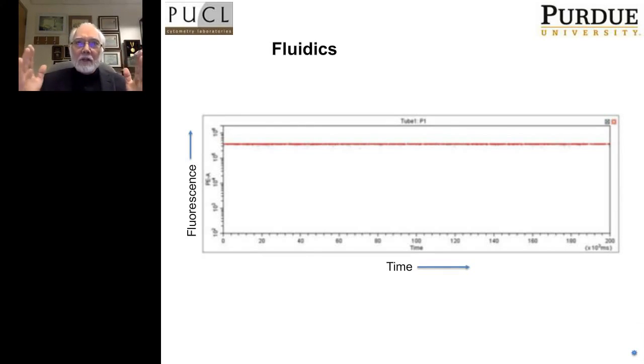And we know that in traditional flow cytometers, where we use positive pressure systems, we have very sophisticated pressure and fluidic control.